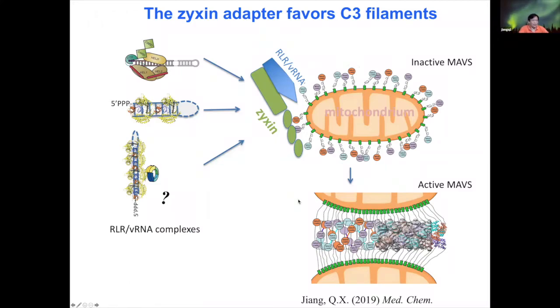There is another unsettled point about the length of this double-stranded segment. X-ray crystallographers tend to think that this can be as short as 10 base pairs. But in our hands, in our assays, we found that 20 base pairs is actually required, which means that the minimum active form is actually a dimer.